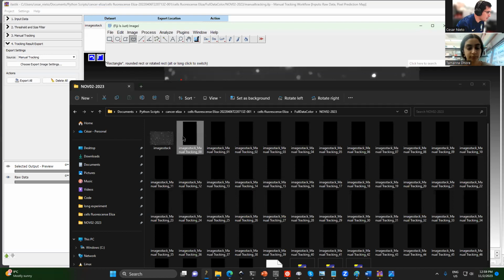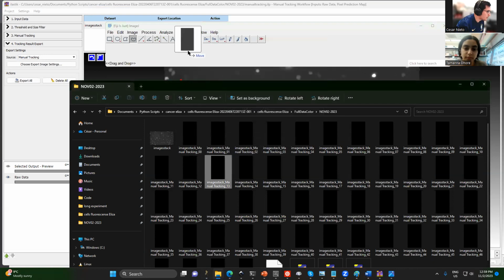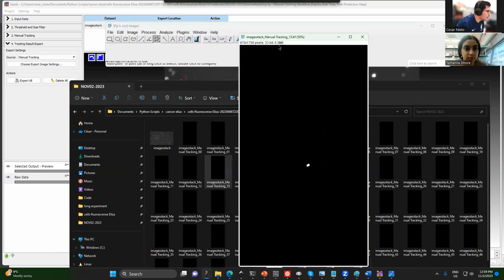Because this file has how many pixels? Maybe I made a mistake. Here is 970.